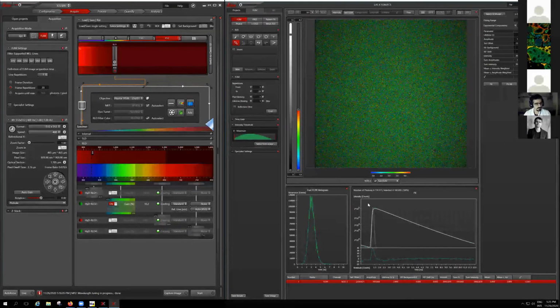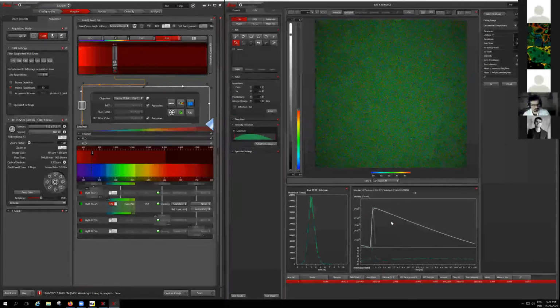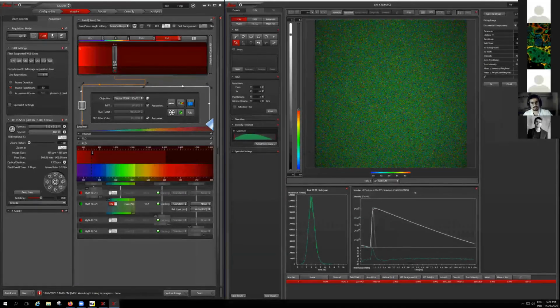There is something here that's very important. This adjustment on the peak of the decay curve, there's really a little bit of mismatch that we see here. The chi-square is about 12. It doesn't seem to work very nicely. So what might be the reason?